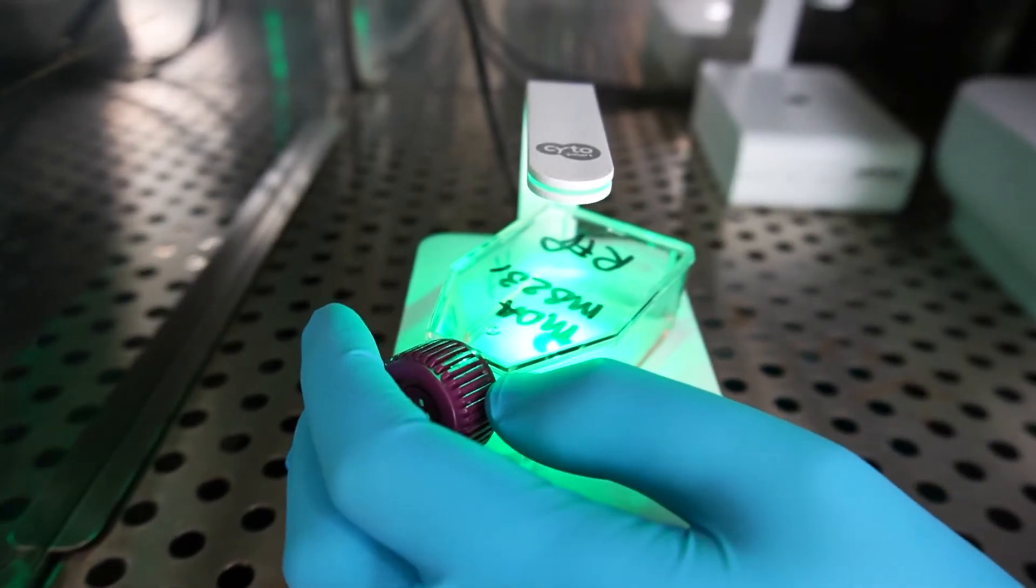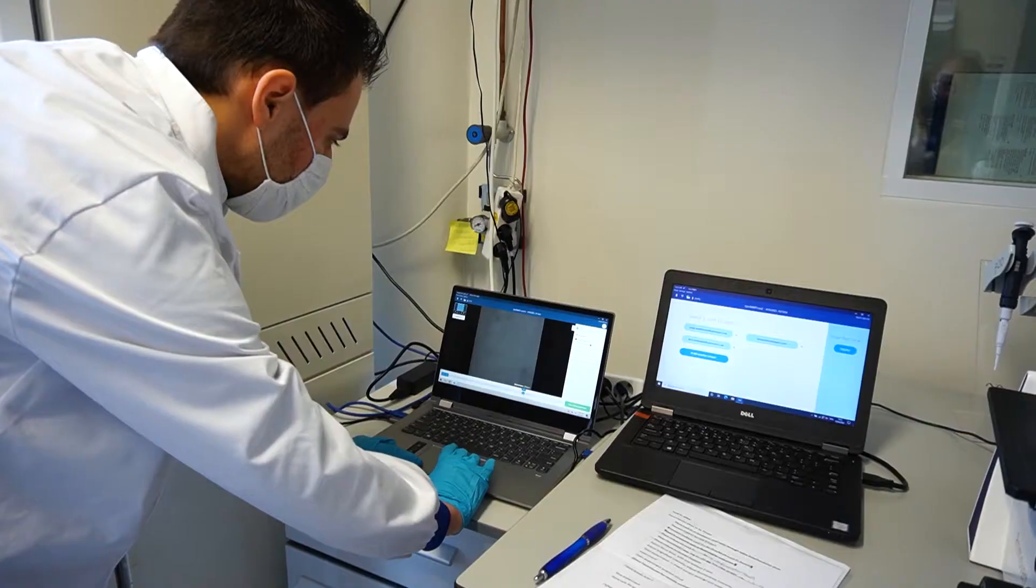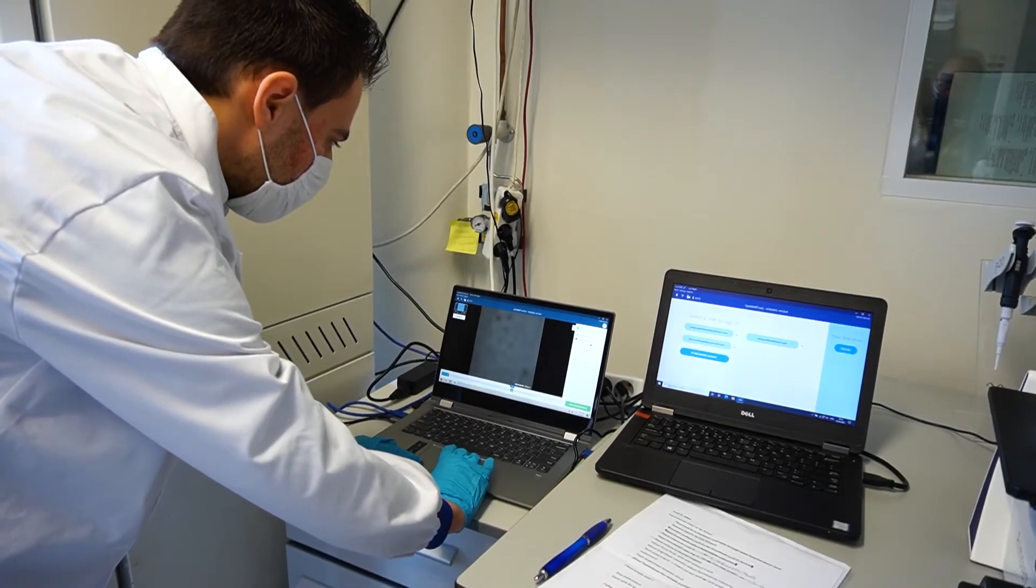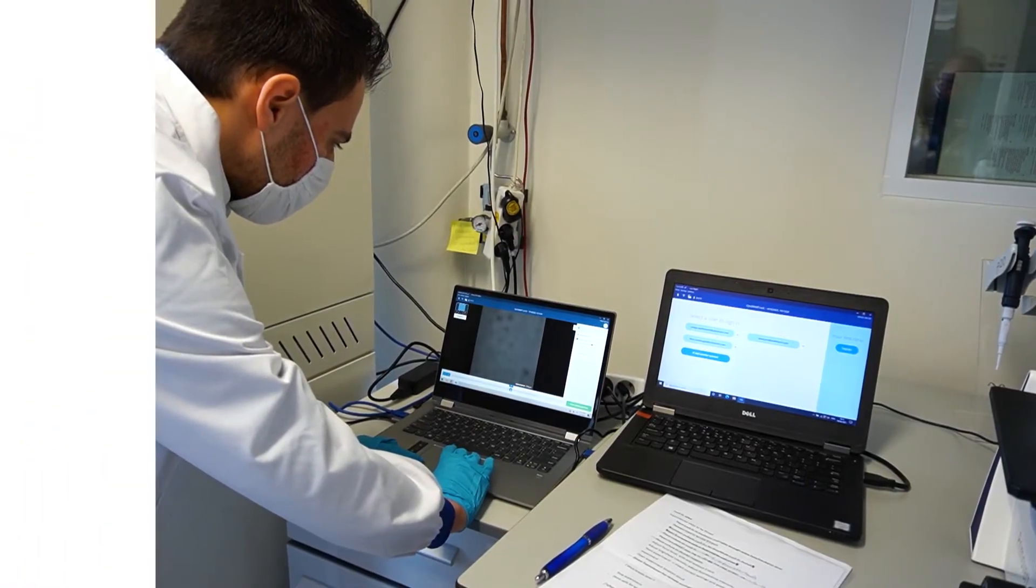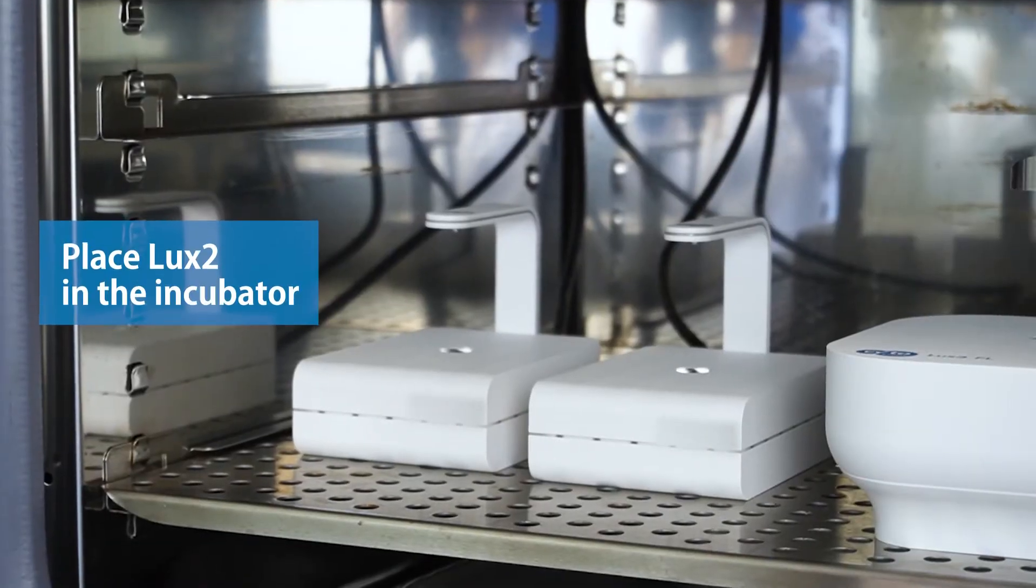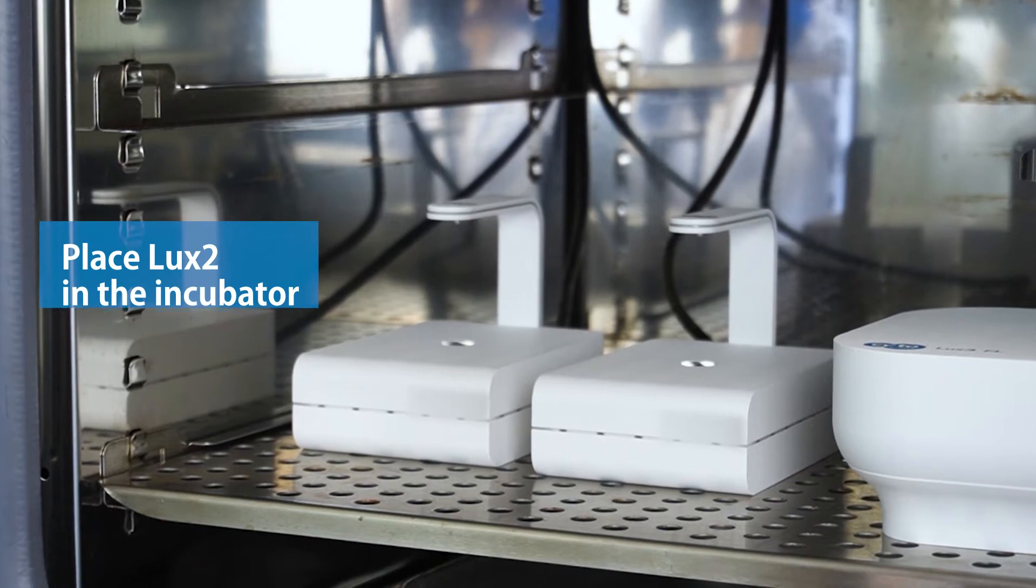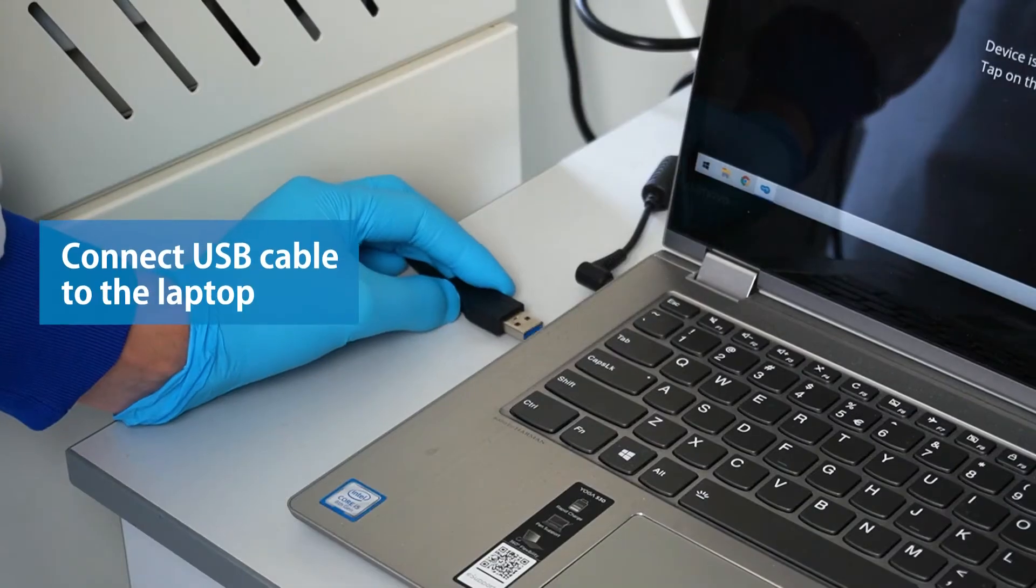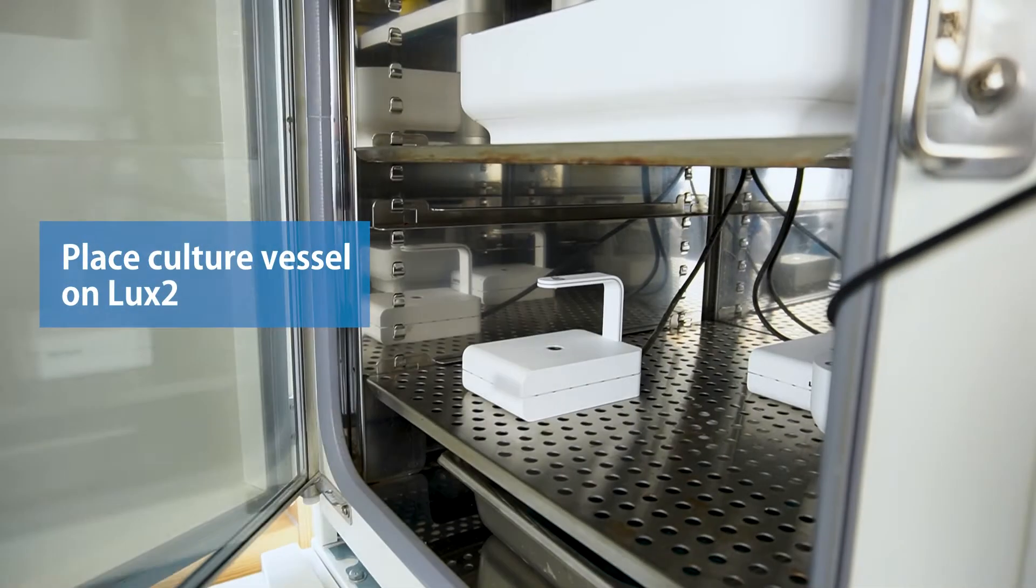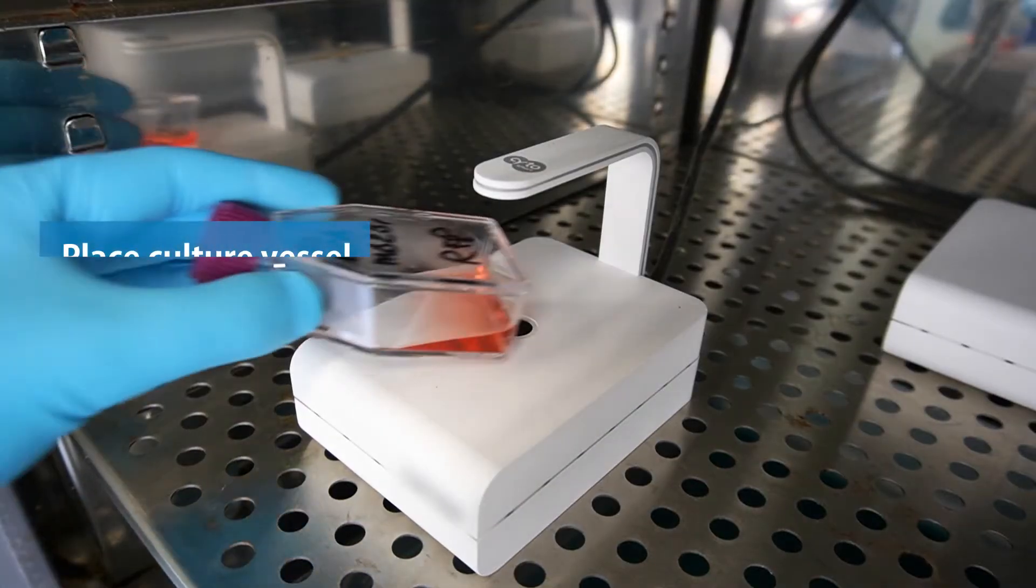Setting up an experiment with the Lux2 is plug-and-play and requires no extensive training. To install the Lux2, place the device in the incubator and connect the USB cable to the laptop. Now place your desired culture vessel on the Lux2.